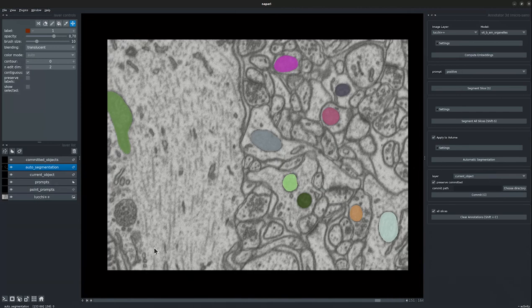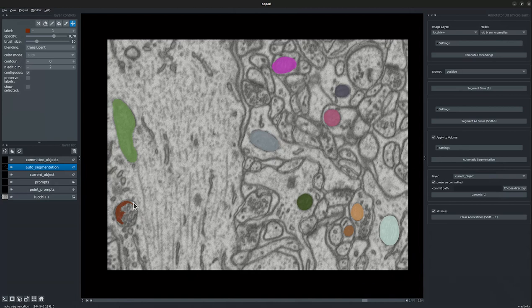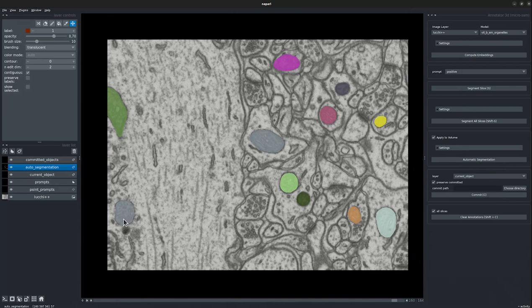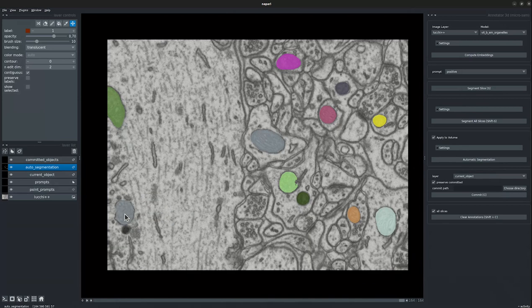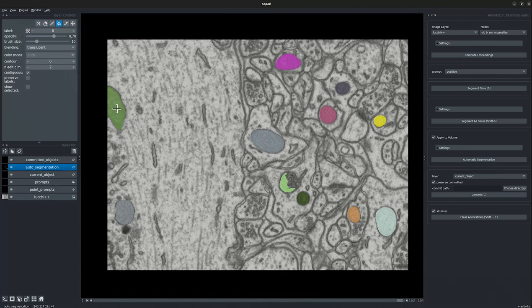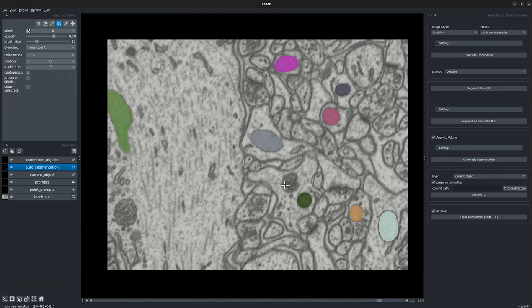We see over here some objects have been segmented incorrectly, over here as well. Let's go ahead and fix them. With the pick mode, we select the background to remove those objects using the fill mode. We change the end edit dimension to 3 to make the rectifications in 3 dimensions. Let's go ahead and remove these objects.